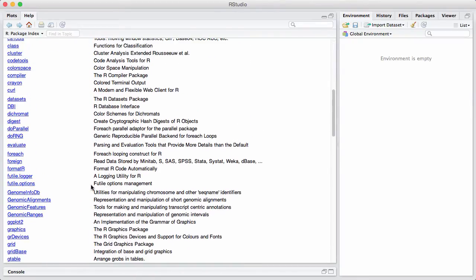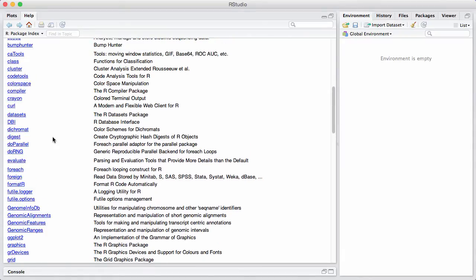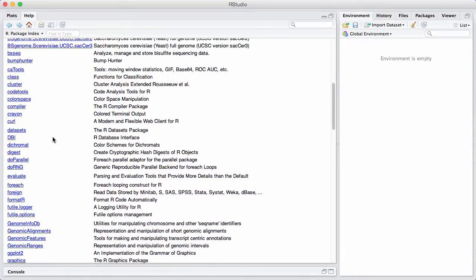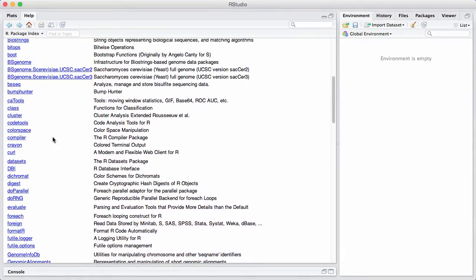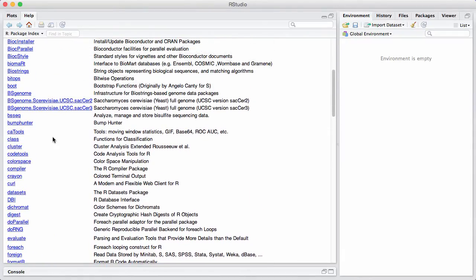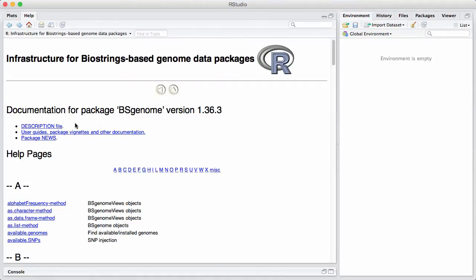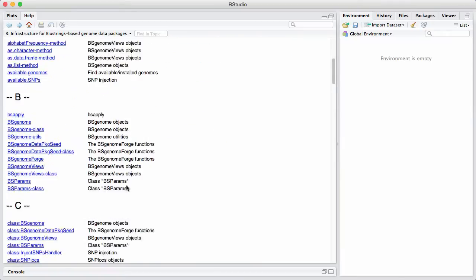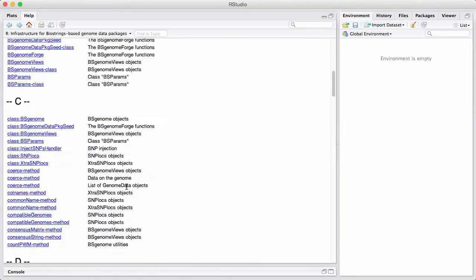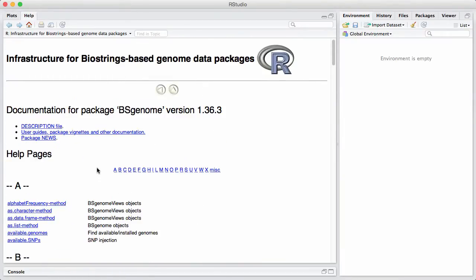In this case here I find I don't have DESeq but let's take another one. Let's take a package called BSgenome. Here there's an index of all the functions in the package. But up here at the top we have a link to the description file. We have the user guide, package vignettes and other documentation and we have the package news.